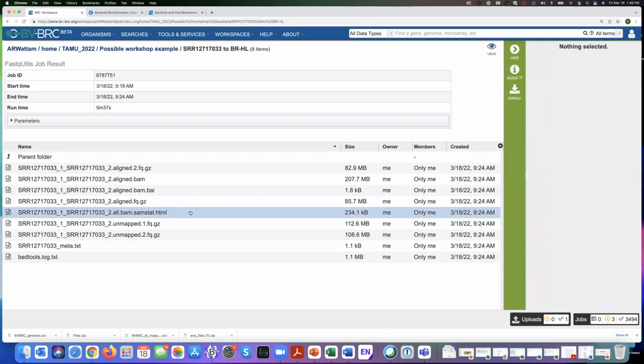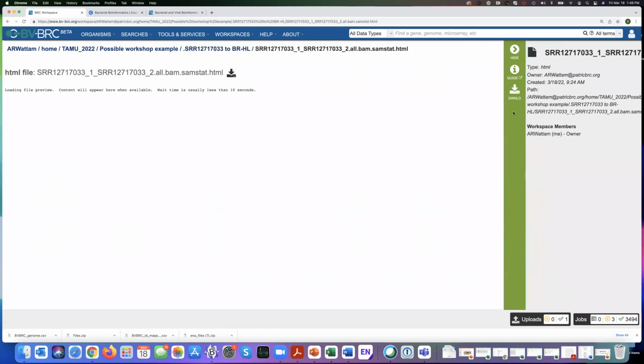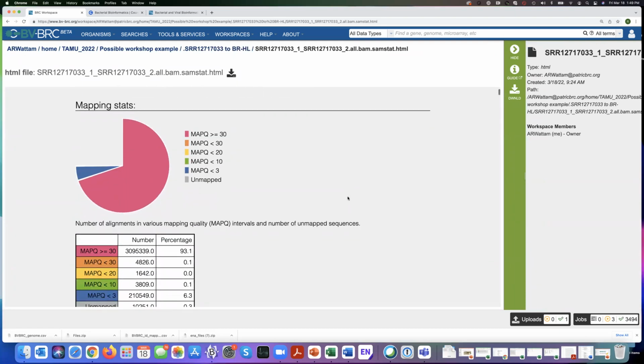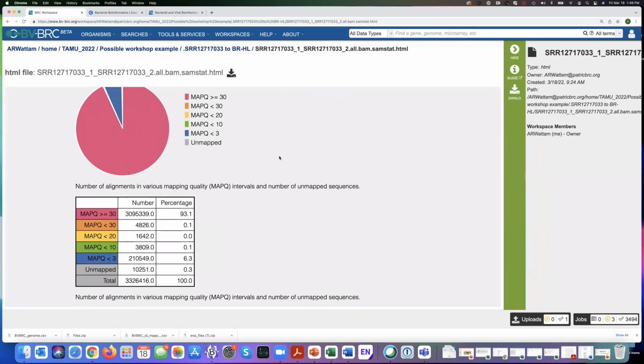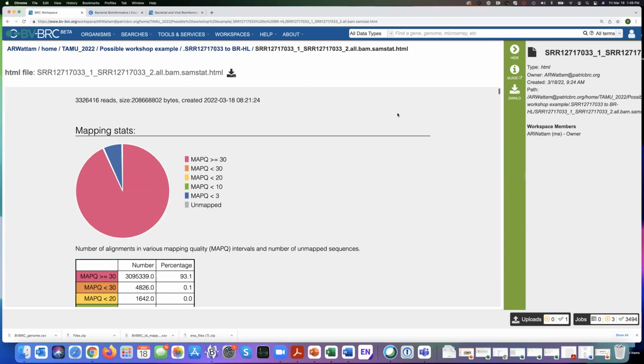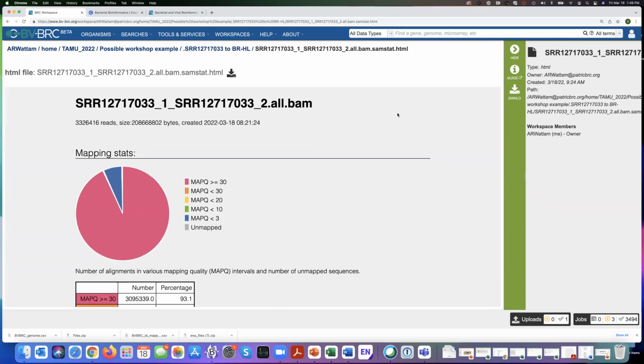Just because this is kind of fun to show you. Wait a second for this one. And so it also creates just a specific folder of the reads that not only mapped, but mapped at high quality. So it would get rid of the bad stuff, and you would have the good reads to use for your assembly. Make sense? Actually, I used this one for the influenza, and I see a lot of reads are unmapped, and very few are mapped, like less than 1%.